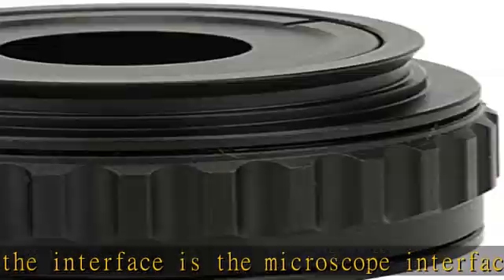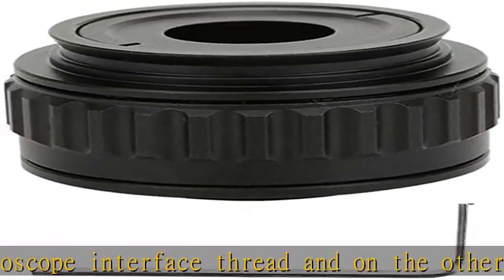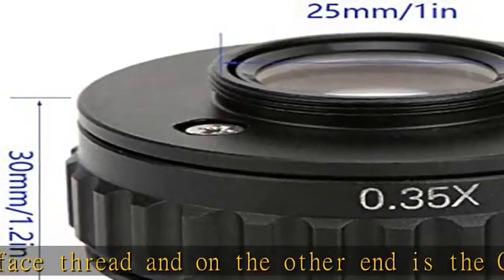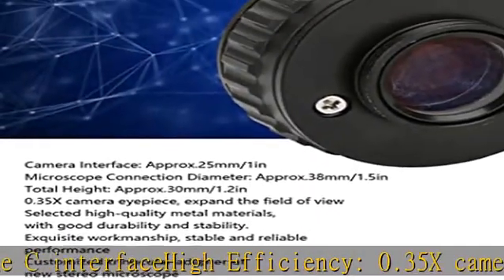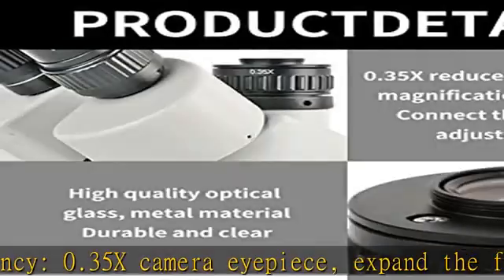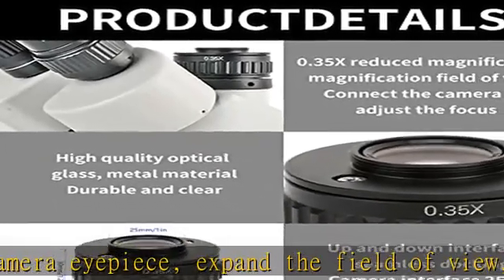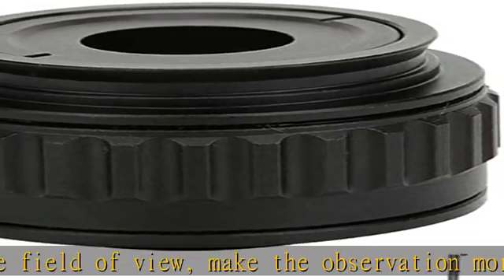Customized trinocular adapter of new stereo microscope with long service life offers stable performance, exquisite workmanship, and stable and reliable performance. Easy to observe the internal structure of small objects. Selected high quality metal materials with good durability and stability. Check the description to get this product today at the best price.